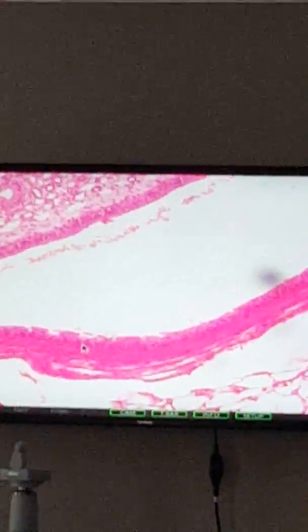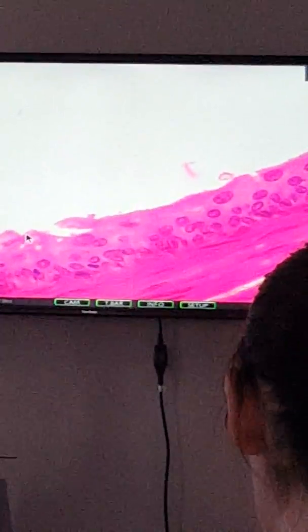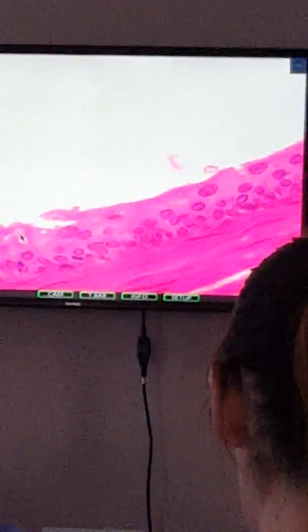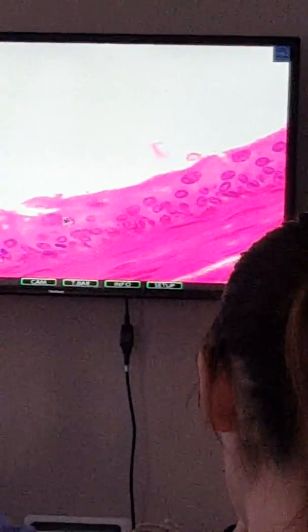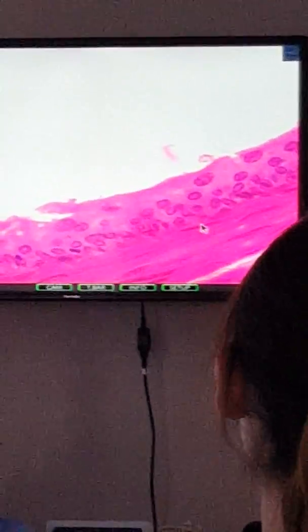We like to think of the superficial cells as being dome-shaped. Sometimes it's more dome-shaped than other times. The cells at the surface don't really flatten out like you have with the stratified squamous epithelium. These would be really flat like this. This was stratified squamous.